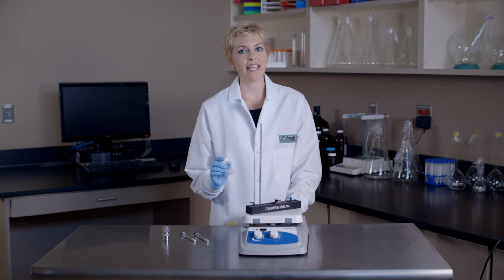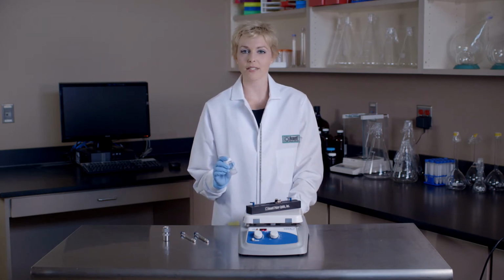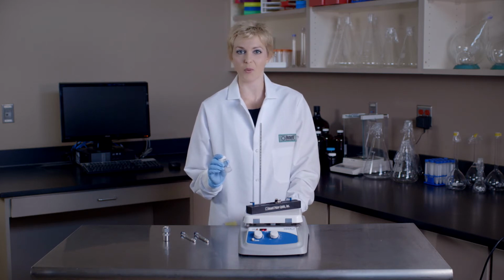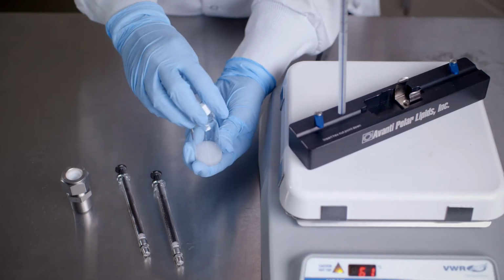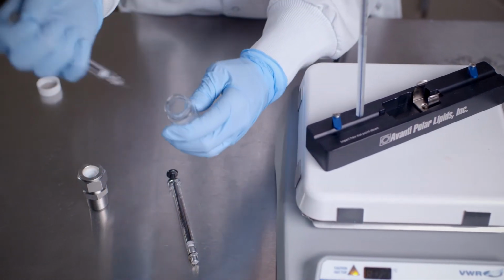As a quick tip, in order to increase the encapsulation efficiency of water-soluble compounds, the lipid suspension may be subjected to 3 to 5 freeze-thaw cycles by alternately placing the sample vial in a dry ice bath and warm water bath. Once the sample is fully hydrated, we will load it into one of our gas-tight syringes.